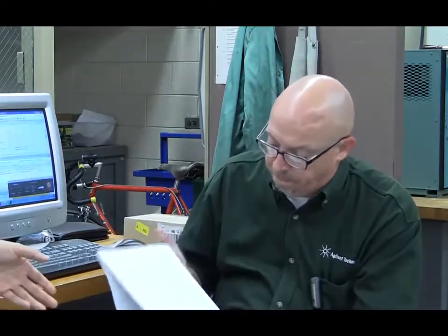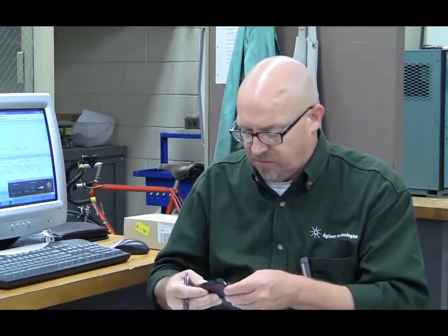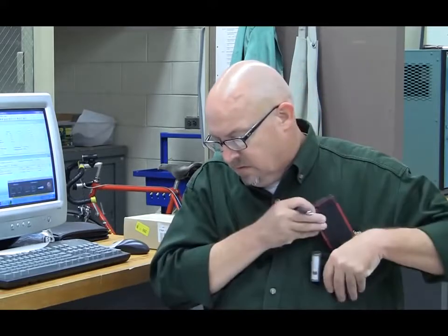Okay, so that's the basic principle. One more time, because none of us are chemists. That's okay, because you don't have to be a chemist, you have to know what the elution order is. This is super important for us to understand.